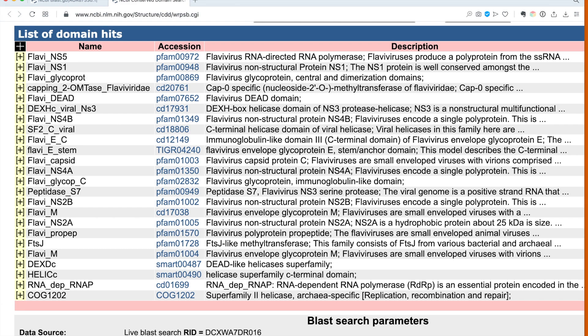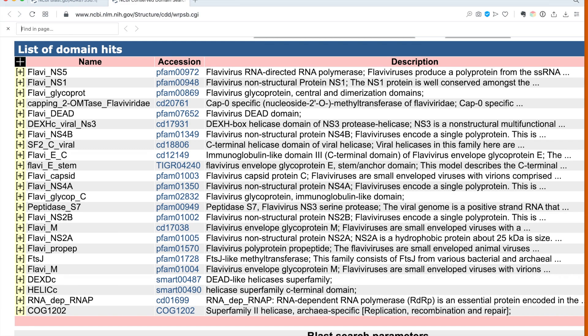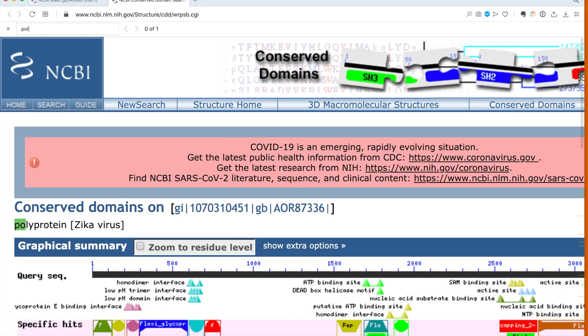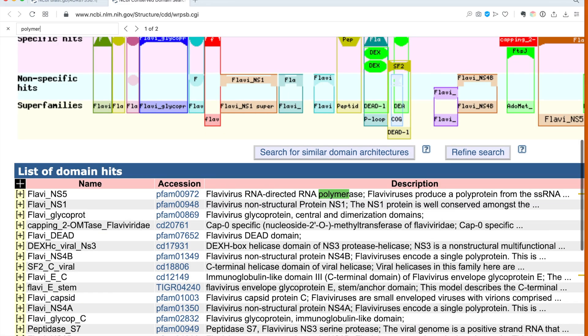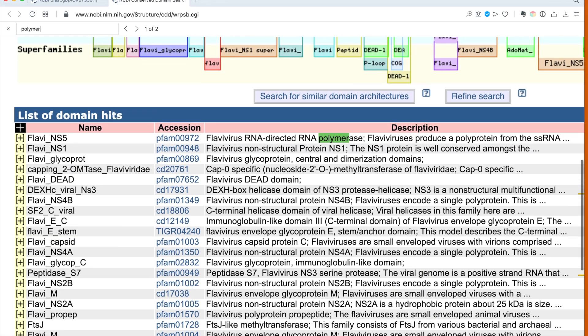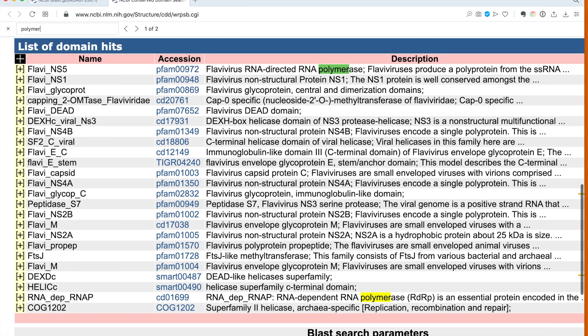Now to find anything that has to do with RNA polymerase, just do a simple text search for polymerase. Just a few letters will be sufficient. I can see two hits with RNA polymerase as a keyword in them.